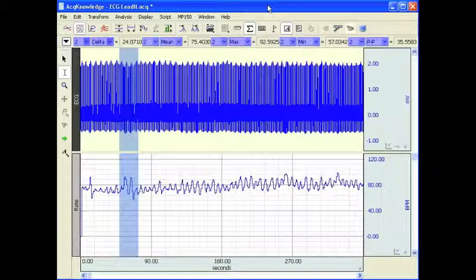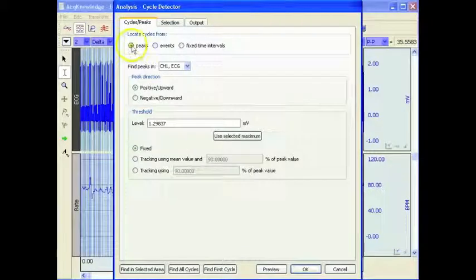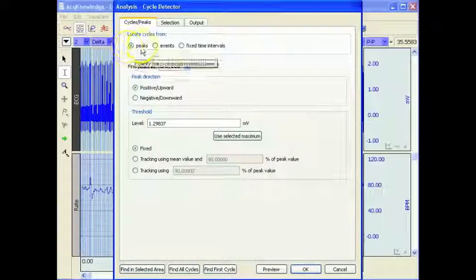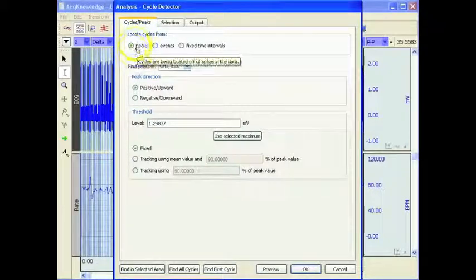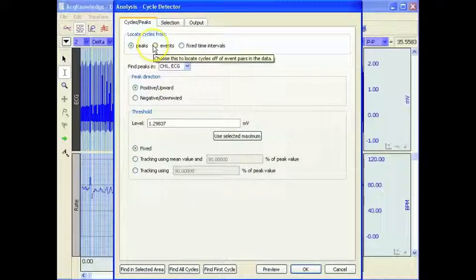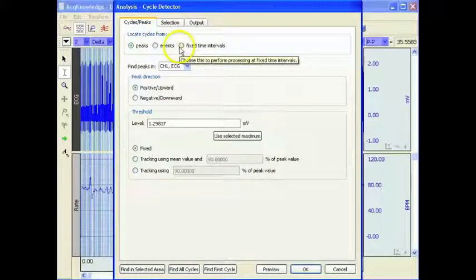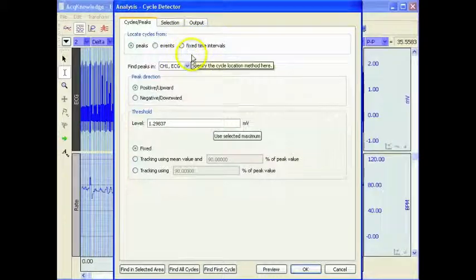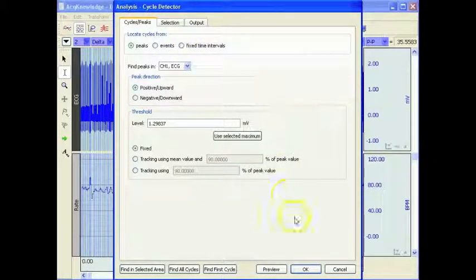The following screencast is about parking — using the tool to locate events within a waveform, to locate events and place event markers. This time we're going to review the fixed time interval feature.